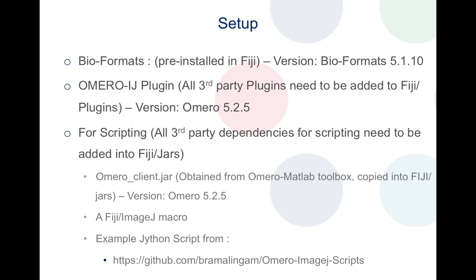For scripting purposes, all third-party dependencies need to be installed under the Fiji jars folder to be used by the Fiji scripting interface. In this case for OMERO, what we'll be adding under the Fiji jars folder is the OMERO client.jar which comes bundled with the OMERO MATLAB toolbox. And the script that I'll be showing in this demonstration is a Jython script which will be run under the Fiji scripting interface and this script will be consuming an ImageJ macro as well.